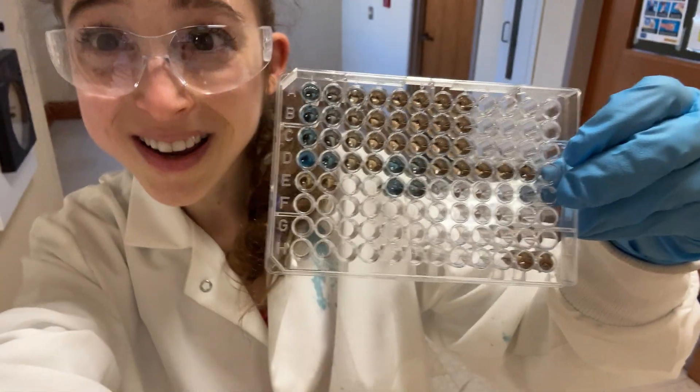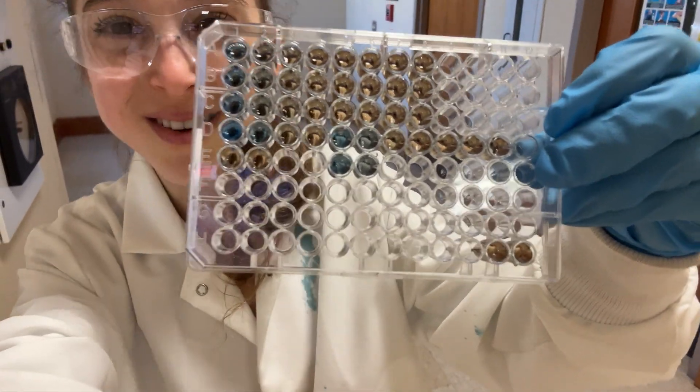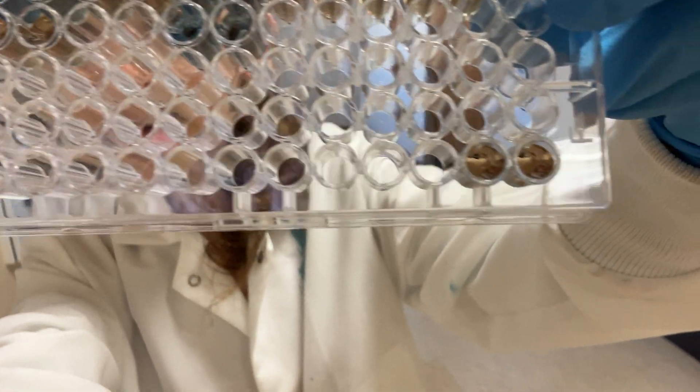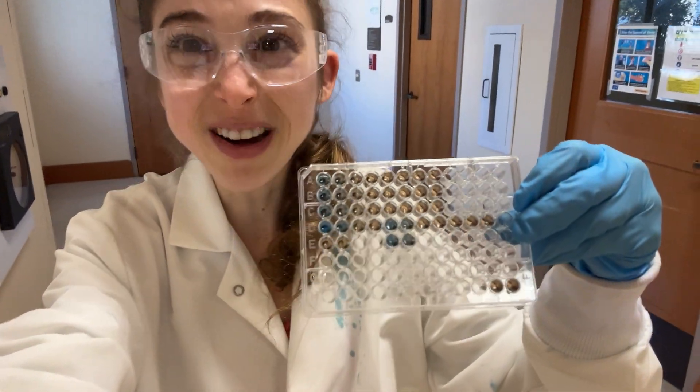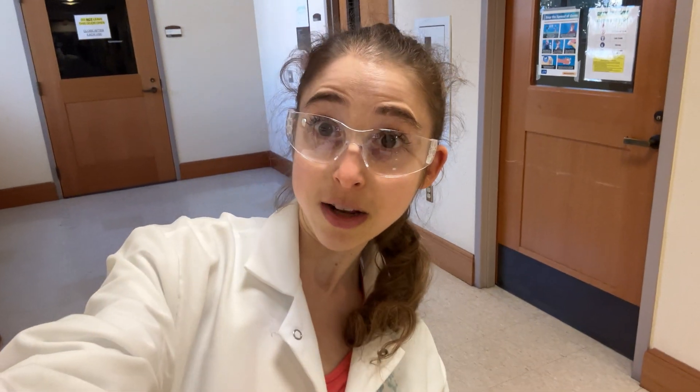I said protein, do you? Hint - it turns Bradford blue. So those samples right in the middle there, that is our purified protein right straight off of the nickel column.